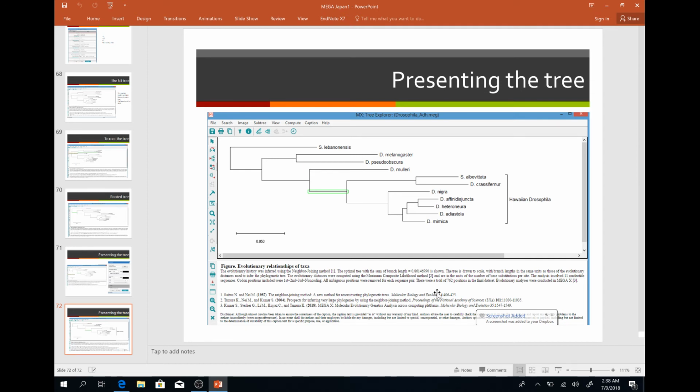So if you remove these sites, your overall alignment may improve. I think the 50% cutoff is a good minimum cutoff. You can remove most of the positions that are missing in most of the sequences. There's no point having data that is so wholly missing.